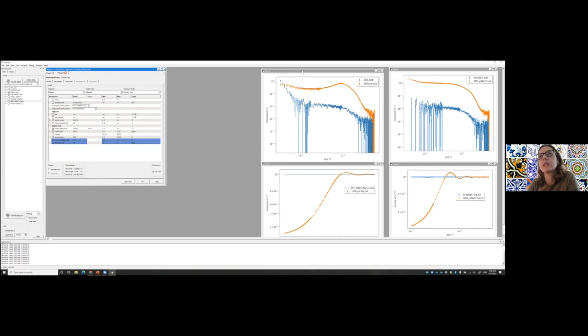Okay, so just before we wrap up, I put some suggested discussion points in your instructions. Here, I plotted, on the left, the 1 in 100 mg per mil solutions with no salt present, and on the right, the 1 in 100 mg per mil solutions of lysozyme with salt present. Let's assume they're exactly the same concentrations. Why do they look different once you add salt to it? Have you thought about it? Does anyone want to comment a little bit?